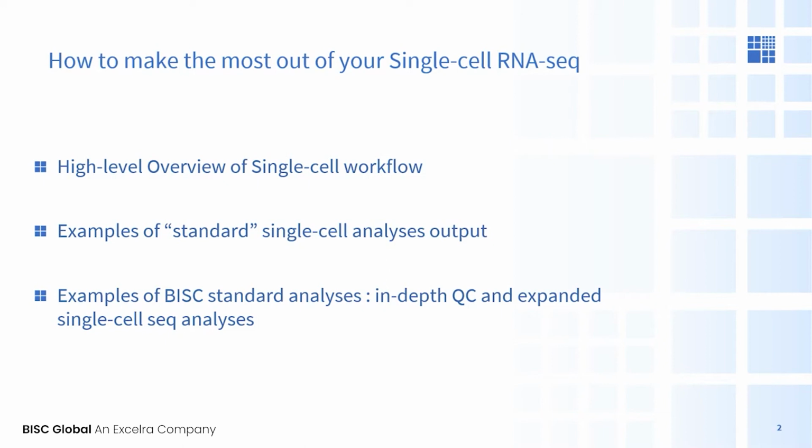So we'll kick it off with a high-level overview of the workflow, and then move into some examples of the quote-unquote standard single-cell analyses that you will commonly see in the literature. And then in the second half, move on to examples that we at BISC think should be part of standard analyses, including additional in-depth QC and cluster optimization steps, and expanded analyses including pseudotime analysis and gene regulatory network analysis.